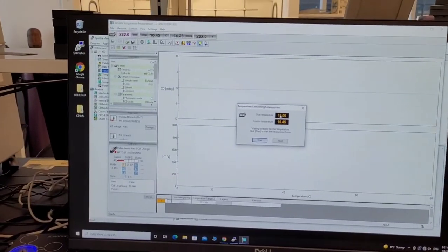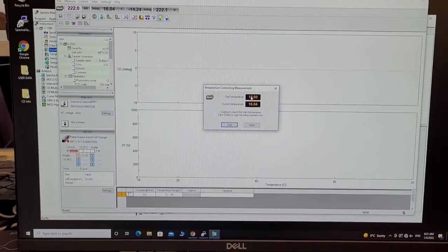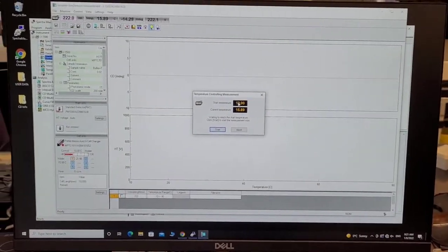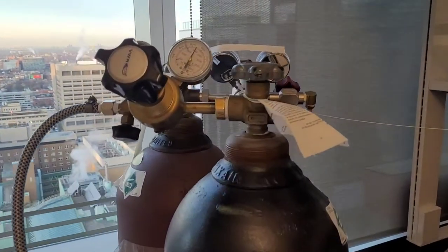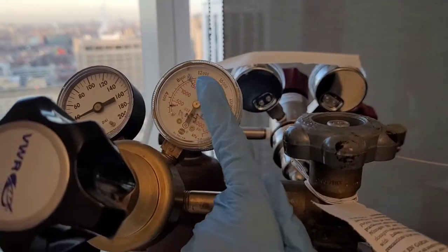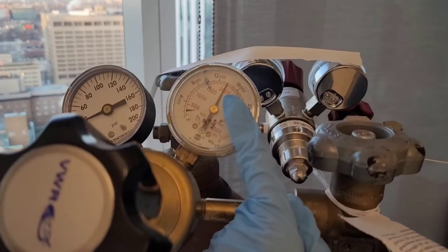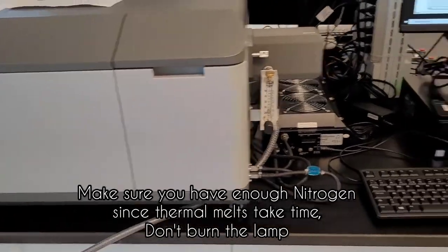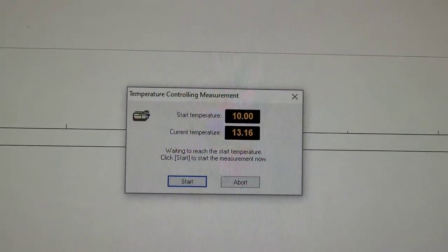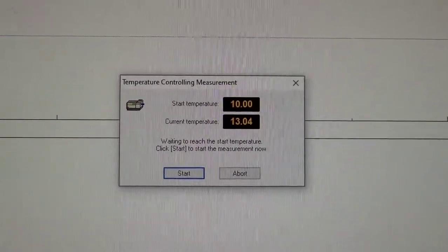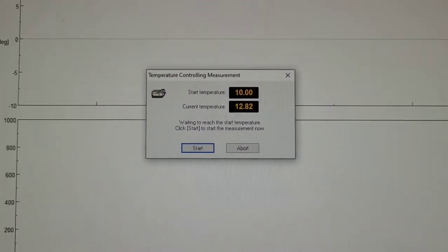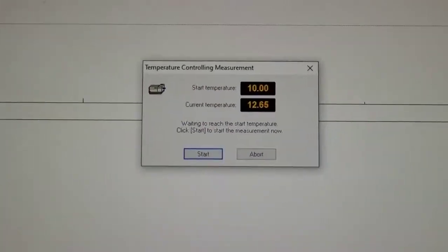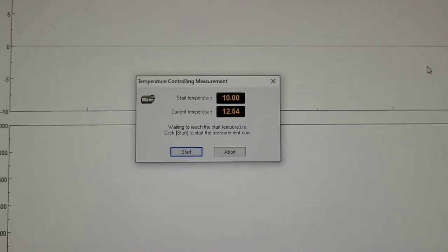I think that you want to make sure before doing a thermal denaturation, because it does take about an hour, you want to make sure that you have enough nitrogen left. Otherwise, it's not good for the instrument and you might burn the light. You're just waiting until the temperature reaches 10 degrees. And for this, you definitely don't want to skip it like I did the first time and let it reach the selected temperature.